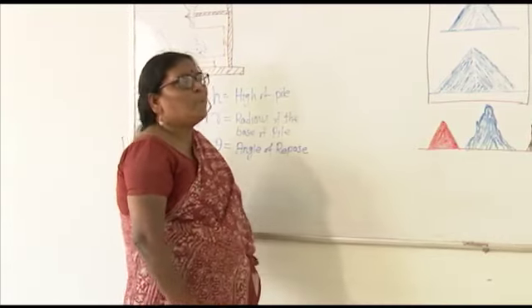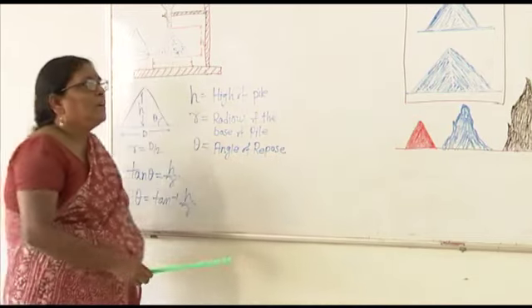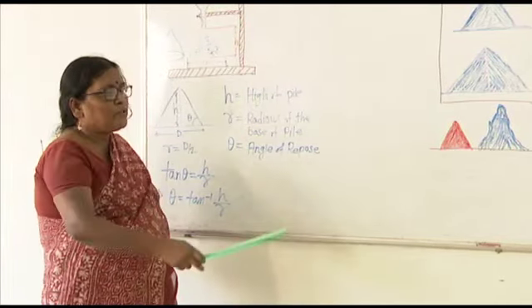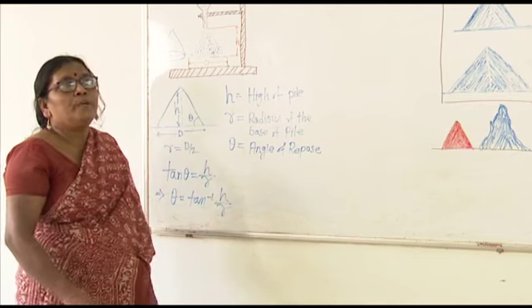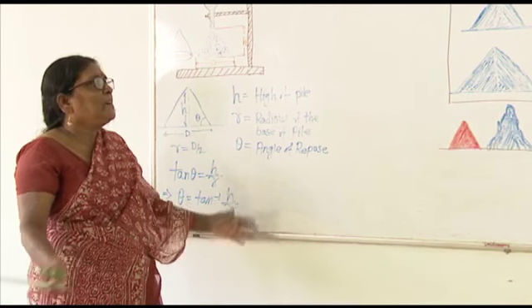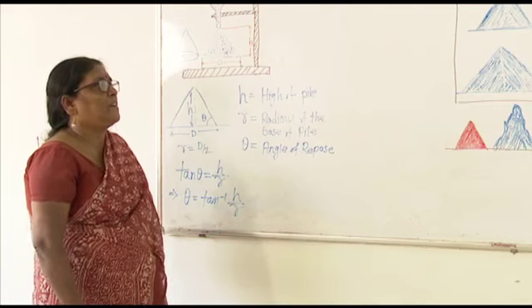Actually, this is important in pharmacy. It gives you very valuable information. In pharmacy, the most popular dosage form is the tablet, and the tablet is actually volume filled. From the hopper, the granules come to the die by flowing, and if the flow is interrupted, you don't get uniform tablets. In mixing also, you have to take lumps of materials and mix them thoroughly. So if they do not flow freely, if there is too much friction, the mixing becomes difficult.